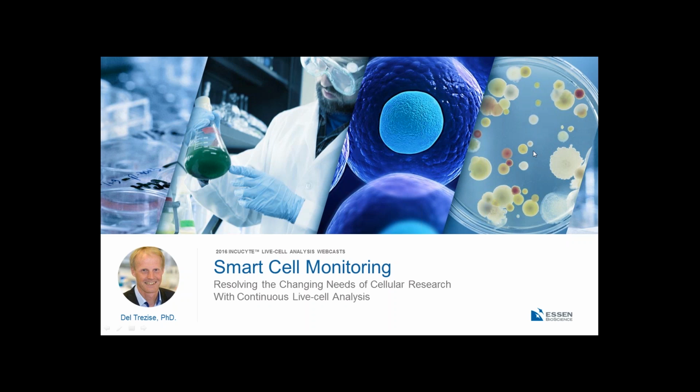The title of the presentation is, as hopefully you can see on the slide, Smart Cell Monitoring, Resolving the Changing Needs of Cellular Research with Continuous Live Cell Analysis.